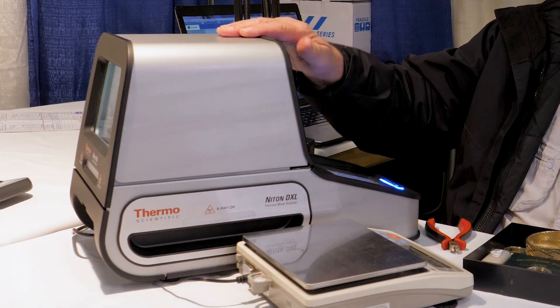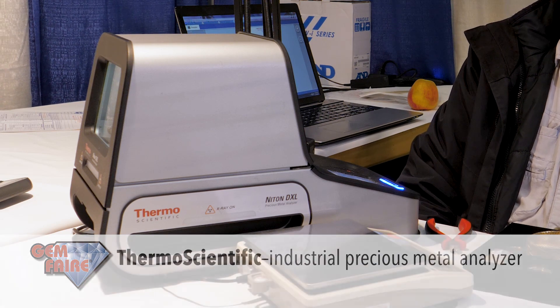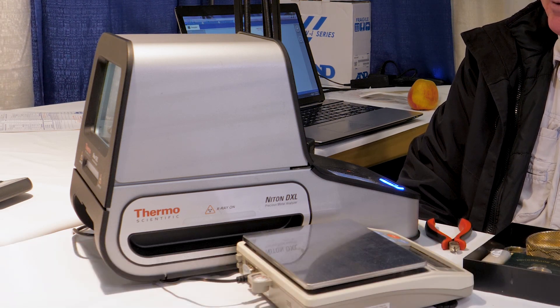My name is Steve Small with Gem Faire. Today we're with the Niton DXL — it's a metal testing machine. It tests the composition using x-ray, breaking down all the different elements in each one of the metals. It'll tell you how much gold, copper, etc. are in each piece of your jewelry.